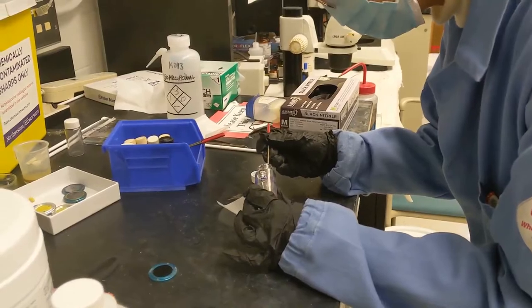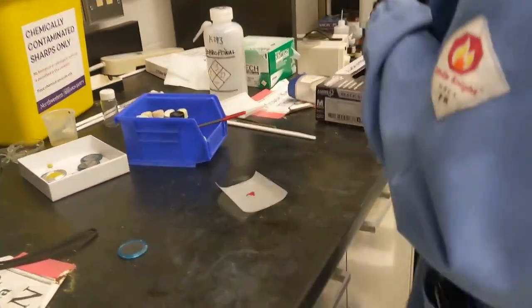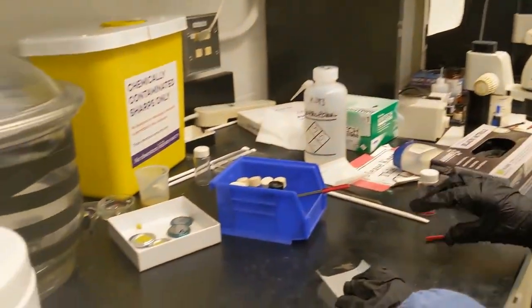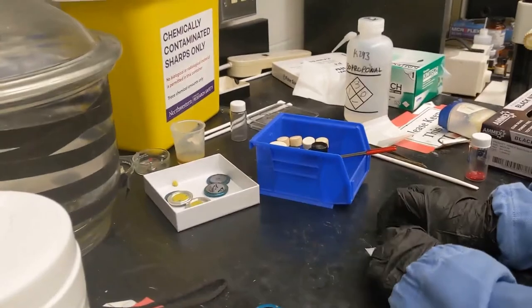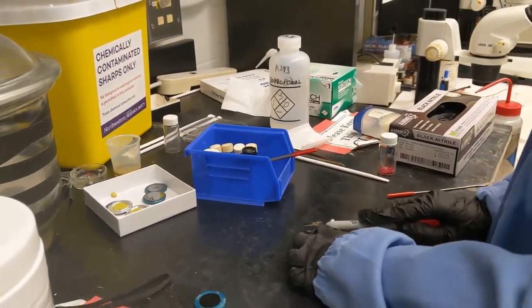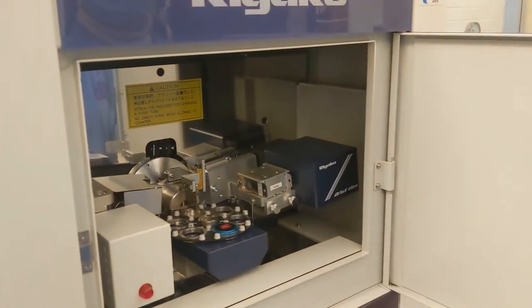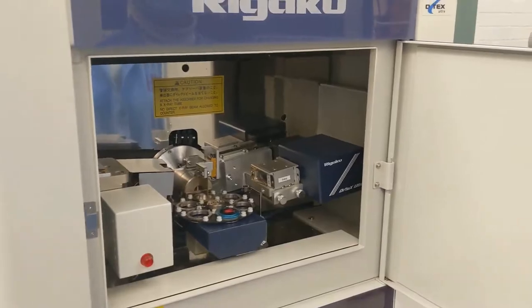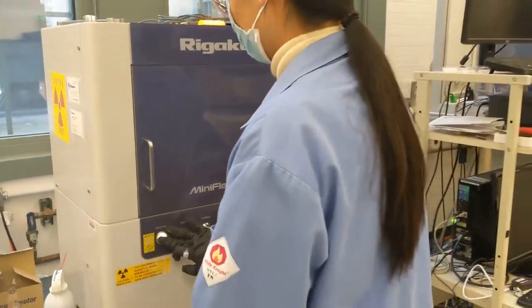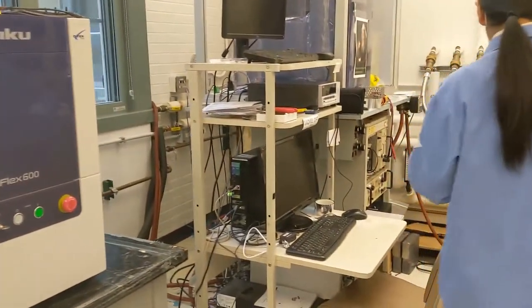Here Xiaotong is prepping a sample for measurement by powder x-ray diffraction. She has a really nice red perovskite and she's going to load that onto one of the masks, and then it will be ready to run in our in-house instrument. Here's our powder x-ray diffractometer. Xiaotong is loading her sample up, ready to be analyzed, and in a few minutes she'll know the structure pattern of her material.